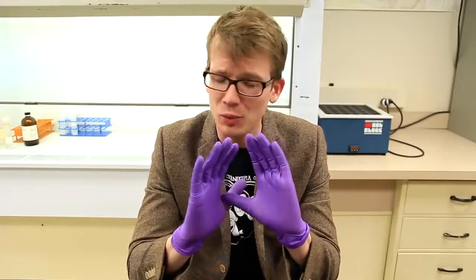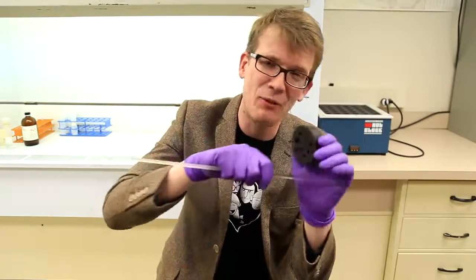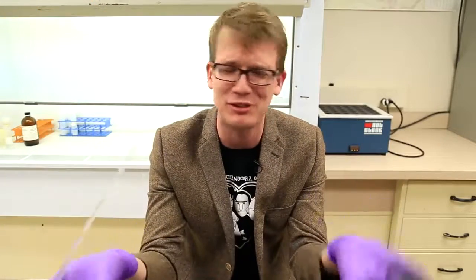But the worst thing, and it has happened so many times and it is so terrible, is forcing a glass rod or a thermometer or a piece of tubing through a stopper, and then it breaks, and then right into and through your hand, and you're in the hospital and you're in pain for the rest of your life probably.